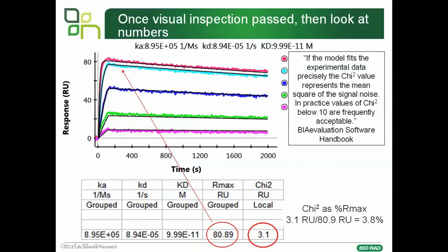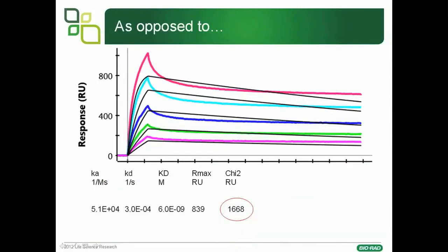Many people quote the chi-squared as a percentage of the Rmax, and want chi-squared to be less than 5% to 10% of the Rmax. In the example here, the Rmax is 80 and the chi-squared is 3.1, so it's less than 4%, and this would be considered an acceptable fit to the model chosen. As opposed to our badly fitting example, where the chi-squared is actually double the Rmax — this would be a grossly unsuitable fit.